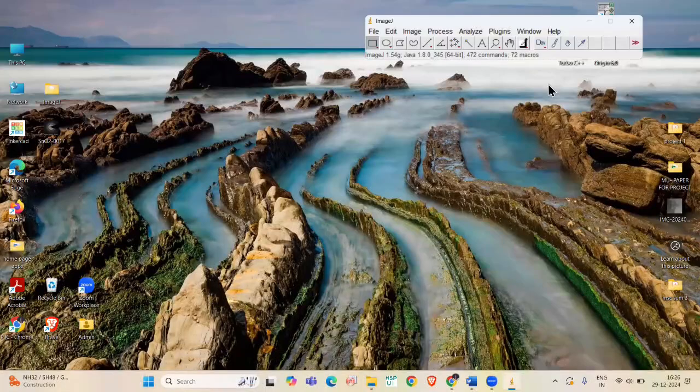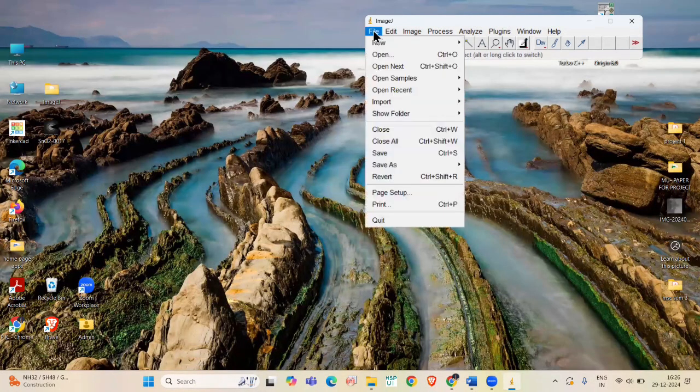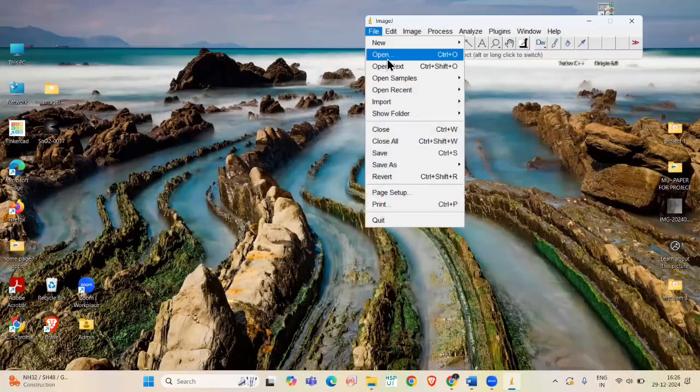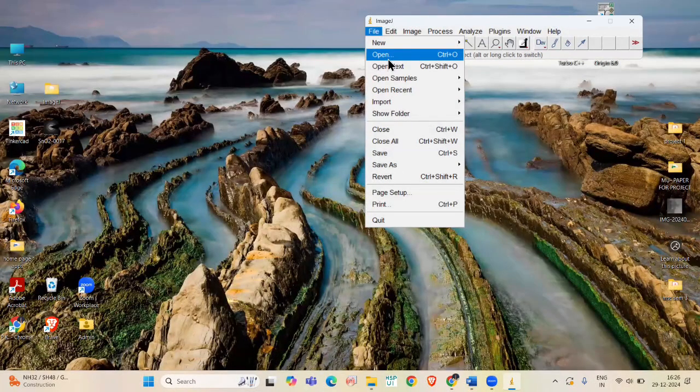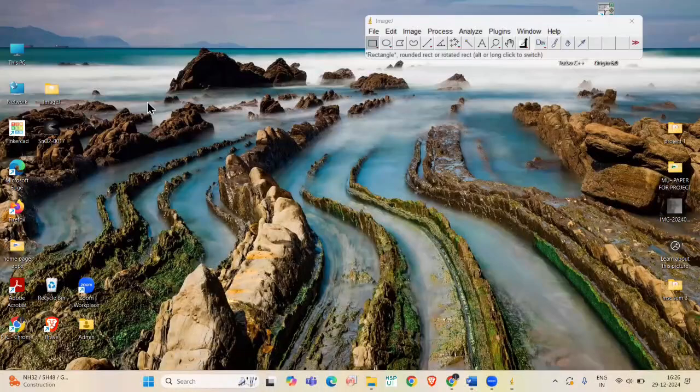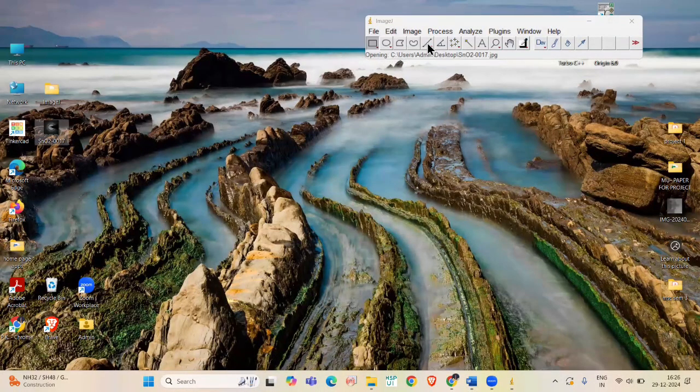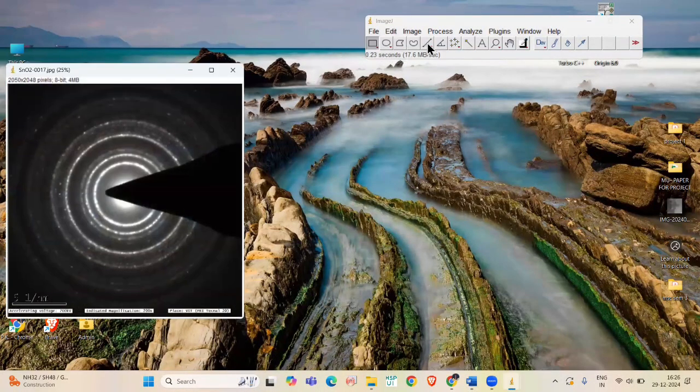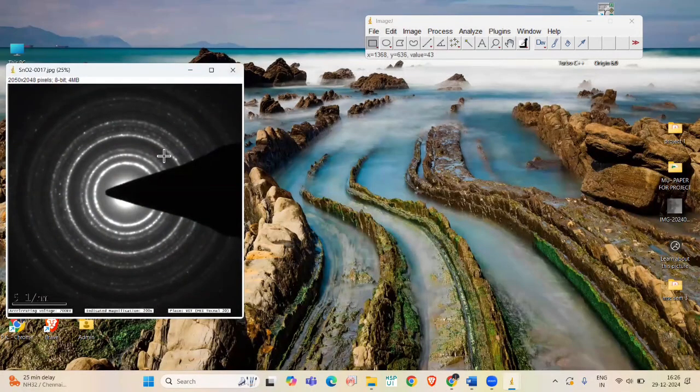Now open SAED pattern. You can either go to File and select Open to open SAED pattern or just drag and drop the pattern into the workspace. Here, I have an SnO2 SAED pattern.